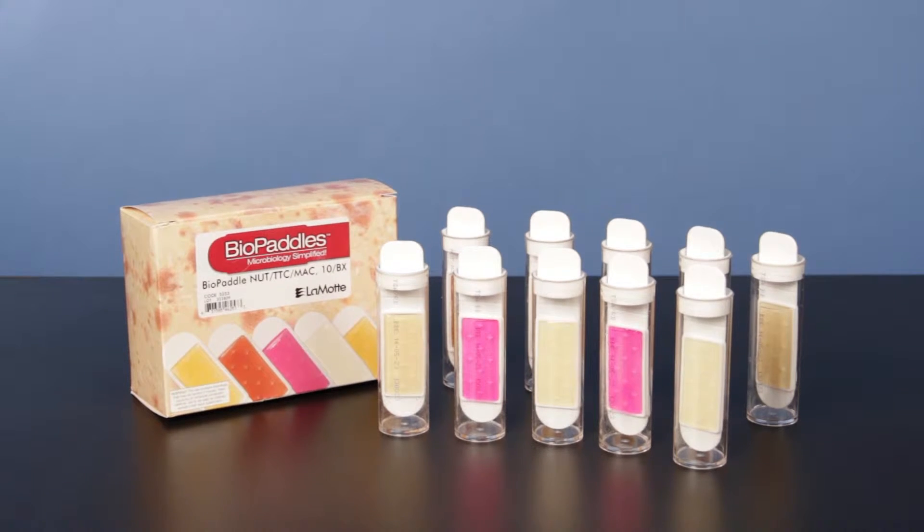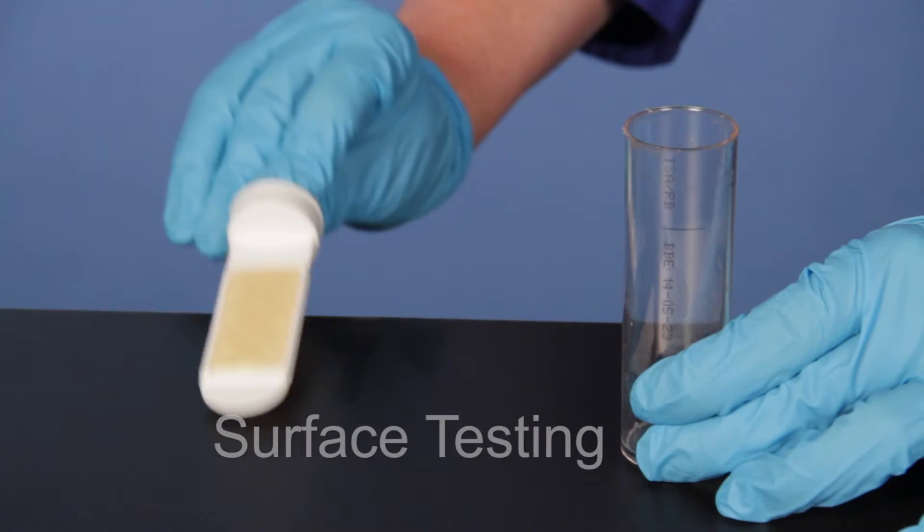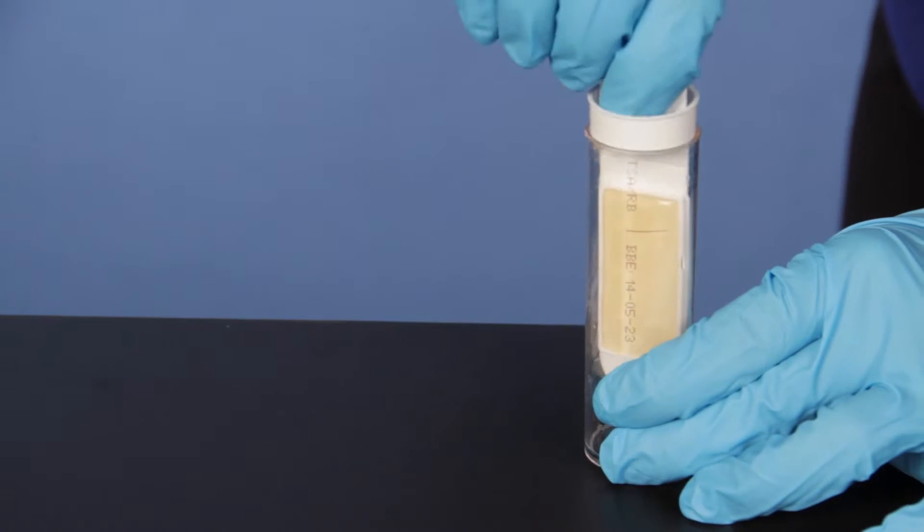LaMotte Biopaddles give you the ability to identify and quantify any microbe in the air, water, soil, or surface, and come ready to use without the need to pour plates.